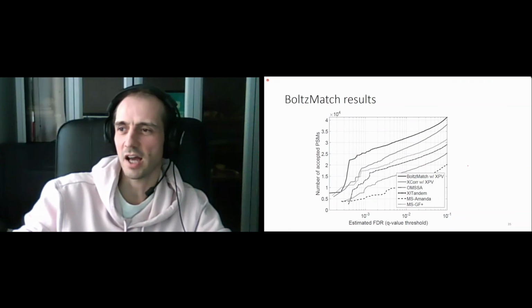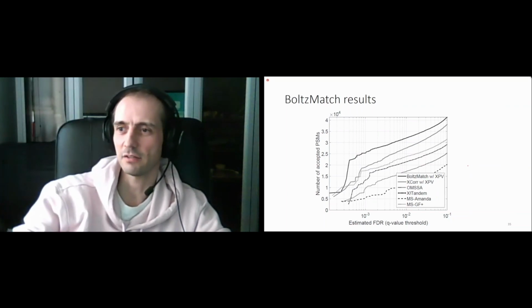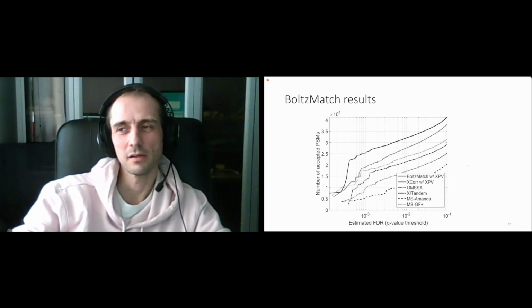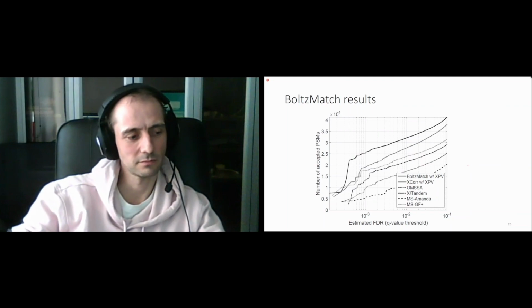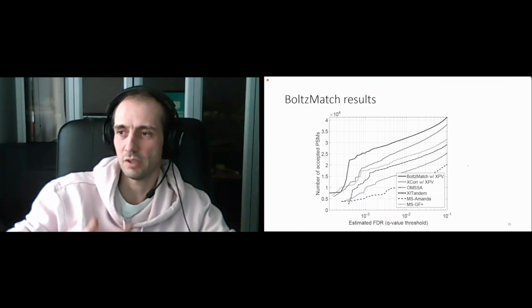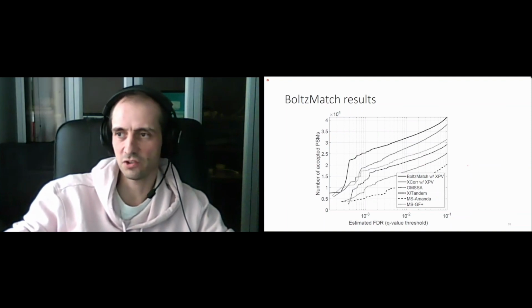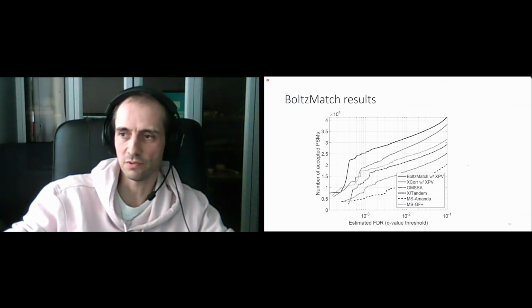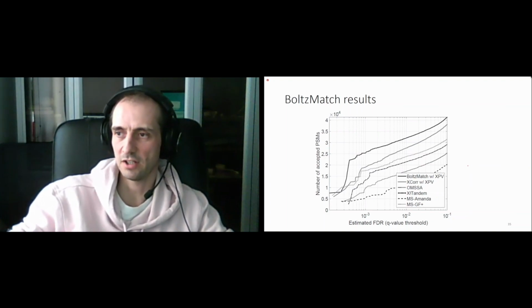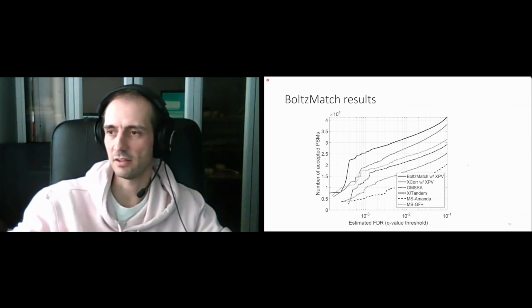Usually you need to choose the type of the instrument, and then it will start working with a predefined parameter set for each type of instruments. Yeah. So what you do is, at the price of training individual machines, you can have higher accuracy. Yeah, so basically we could do this if I developed this method as a software and I would distribute it, then we could get data from each commonly used instrument, train a model on that instrument, and then distribute this pre-trained model, and then it could be used.